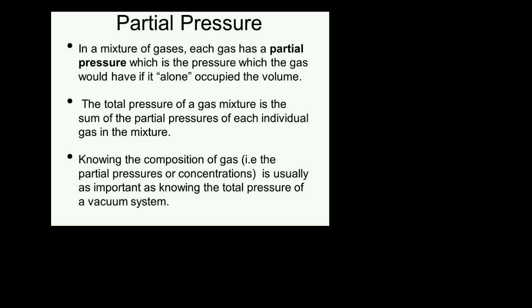We'll be talking a lot about partial pressure today, so I want to make sure everybody knows what partial pressure means. You probably do already, but just in case. If you have a mixture of gases inside a vacuum chamber, each gas has a partial pressure in that chamber, which is the pressure which that gas would have if it were alone in that volume.